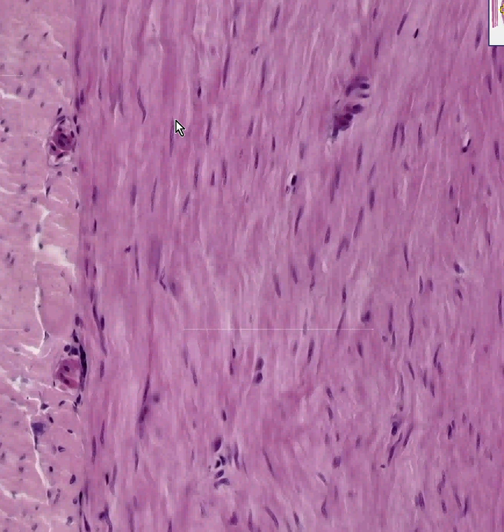If you are looking at smooth muscle fibers which have been cut transverse to their longitudinal axis, they'll look round. If you cut them longitudinal to their longitudinal axis, they will look like little cigars or very spindly. Quite frankly, you could have a very hard time differentiating this from a connective tissue, perhaps dense regular or irregular connective tissue.